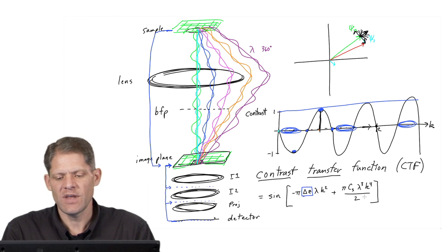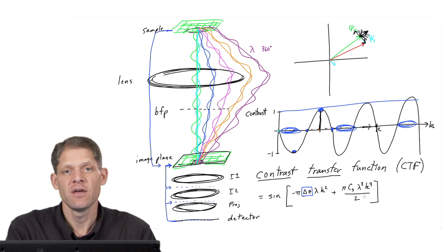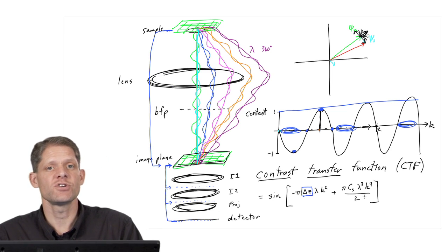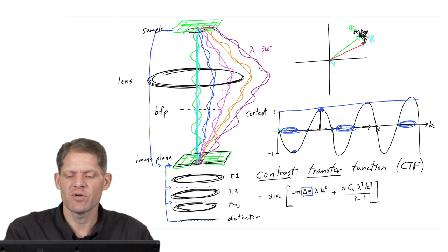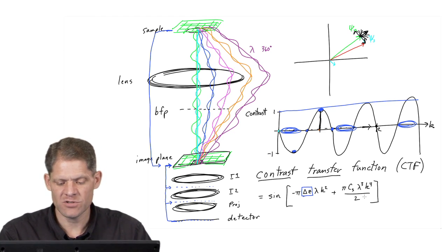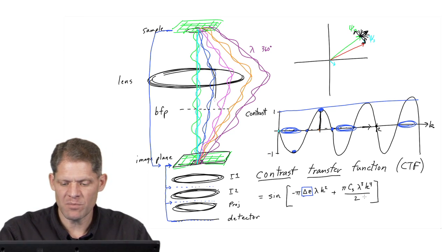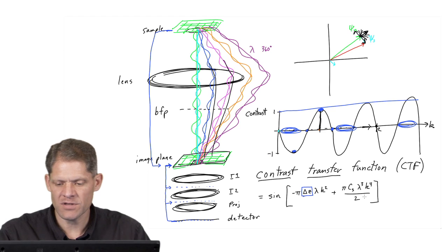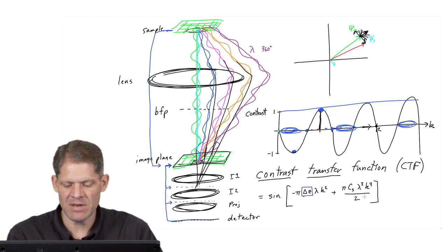Now, if instead you change the focus of the objective lens, meaning, for instance, if you were to turn down the current in the objective lens, the magnetic fields that it produces would be weaker, and therefore it would less strongly focus all of these scattered rays. And so instead of being focused to a point here, the bending would be less and they would focus to a point that's lower in the microscope, say maybe down here.